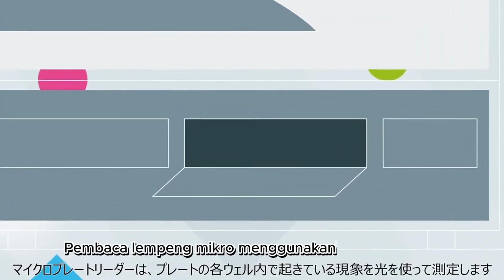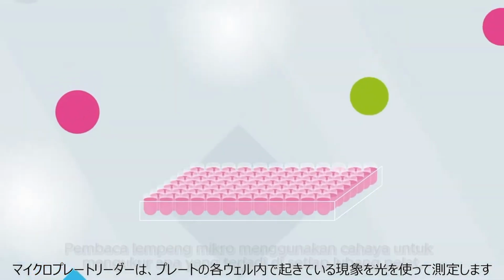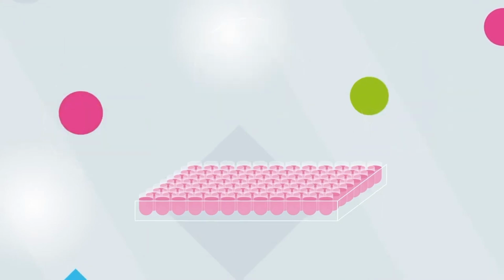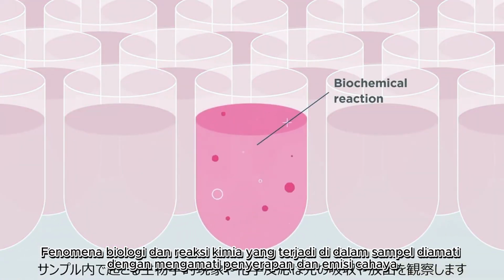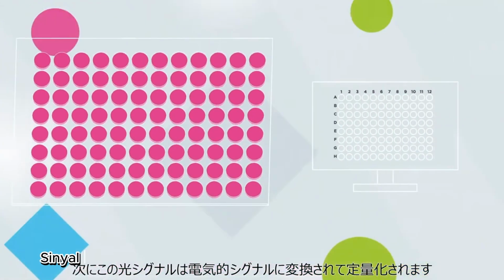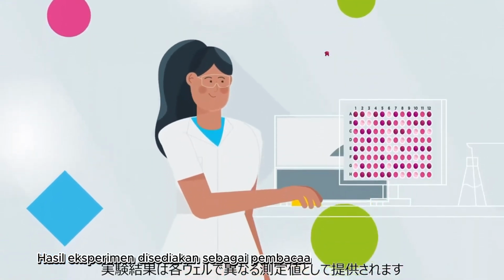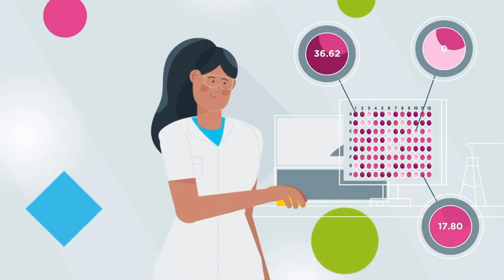A microplate reader basically measures what's going on in your sample, in each well of the plate, as if you were performing a series of experiments without having to set up each one individually. Every process happening in the sample, whether biological or chemical, emits or absorbs a light signal. These light signals are then converted into electrical signals and quantified, giving you the results of your experiment in the form of numbers, different for each well of the plate.